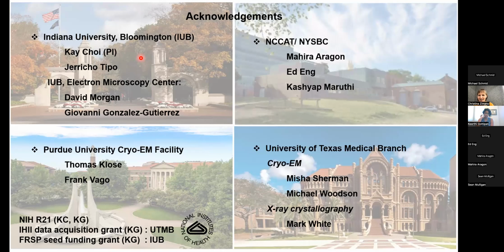So Fab was really useful, and I would love to go back to it. But another issue with the RNA samples is the complexes don't stay together when we blot them. Maybe the blot-free system is what would actually help with that. But especially when we do Vitrobot, even when we mix Fab and RRE together, they don't stay together as a complex, even though Fab itself helps RRE stick to the grid or stick to the ice better.